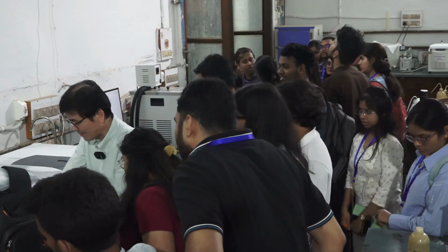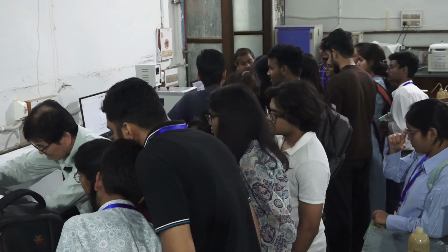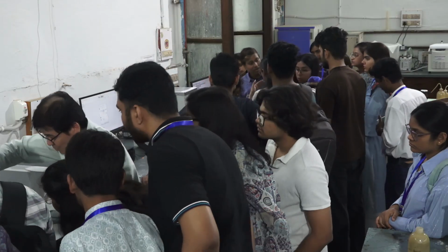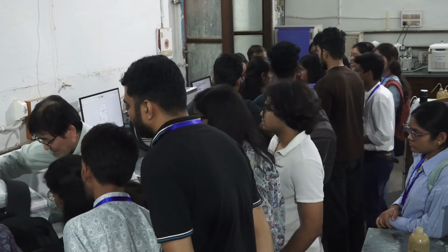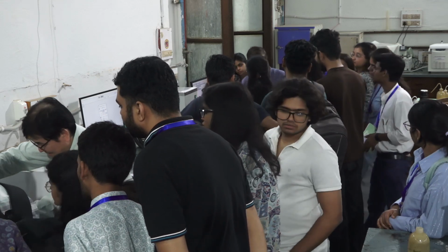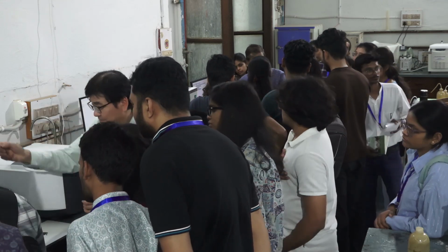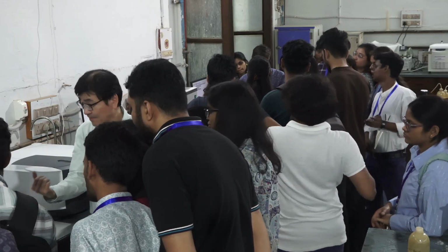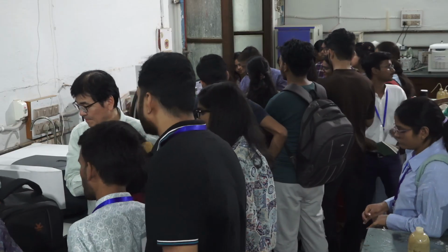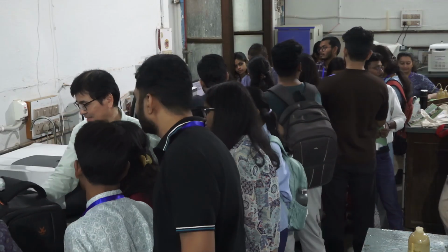Just a moment. So this is a holder to push the sample onto the prism. And please wipe and clean it. Don't scratch.